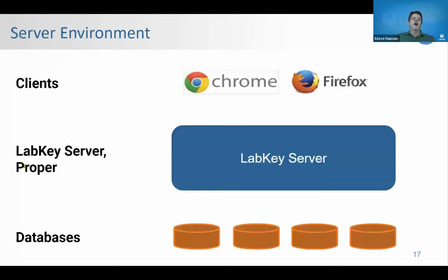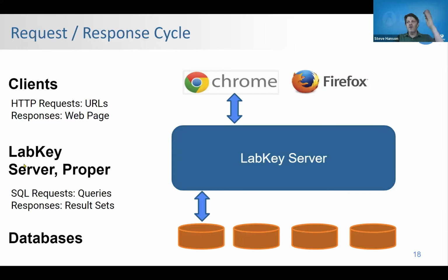A little bit on the server environment. LabKey Server exists sort of stuck in between the browsers and the databases, kind of mediates between them. And basically what happens in those three layers is requests are originated in the browser.